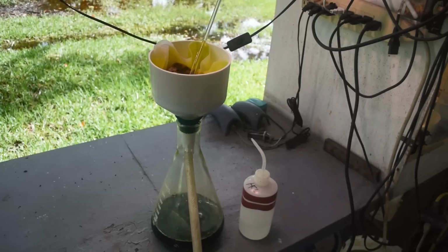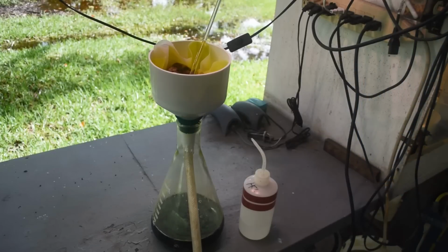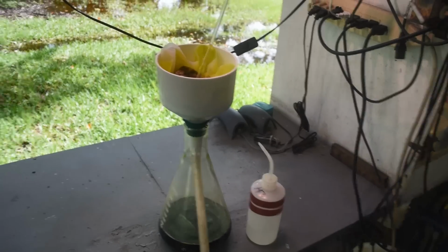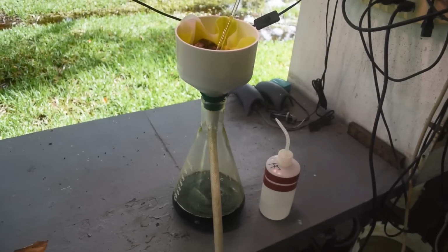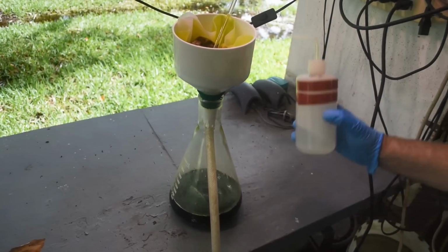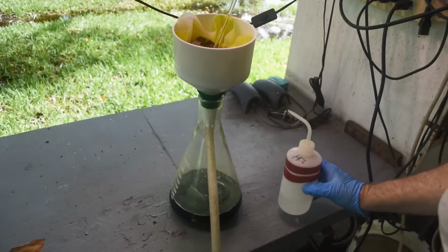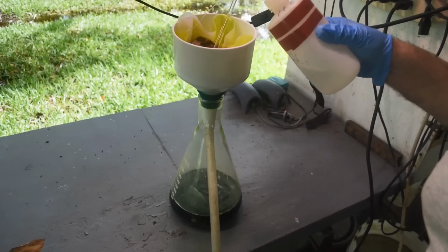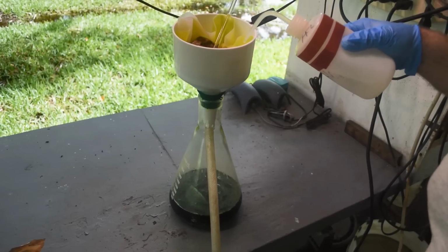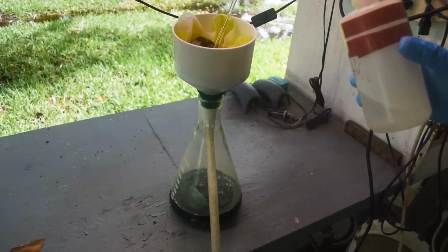And yeah, you haven't even seen all the problems. Well, first off, it's been raining, and this stuff has sat for a couple of days while my lab was underwater over here. And even today, well, I can wait out here. At least it's dry where I'm standing, but if it rains again today, it'll probably be underwater again. So this stuff has sat a while because of the weather. And had some other issues too, which didn't make it on camera. So yeah, it's just been one thing after another, but I think we have finally got our palladium isolated, at least from all of the waste.